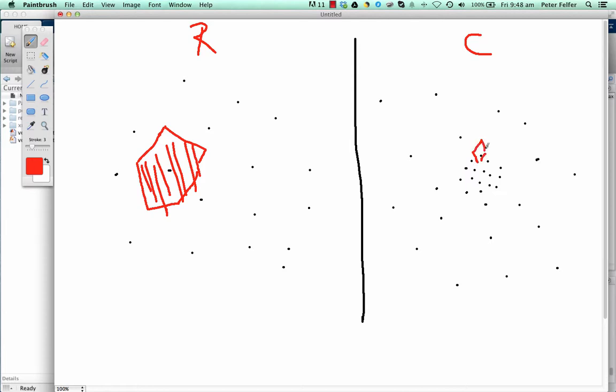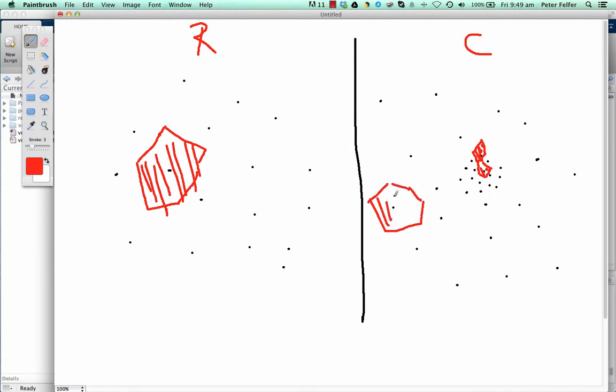You've got the Voronoi cell around this cluster here. This is actually much smaller than the cell size out here, which makes it easy to distinguish between atoms that are belonging to a cluster and atoms that are not belonging to a cluster.